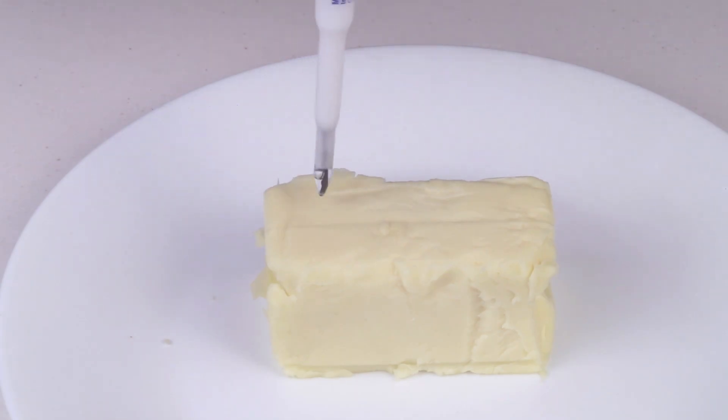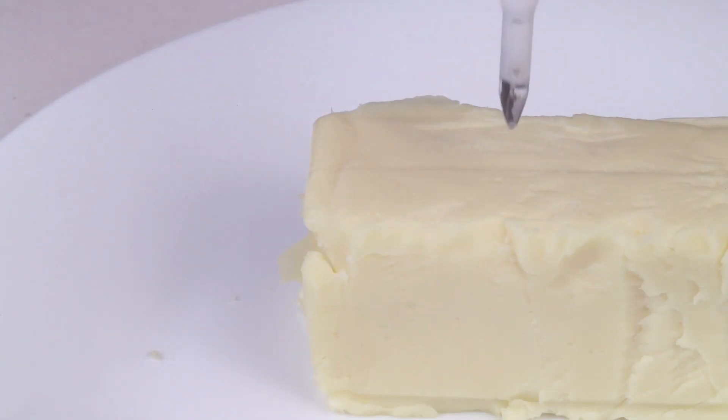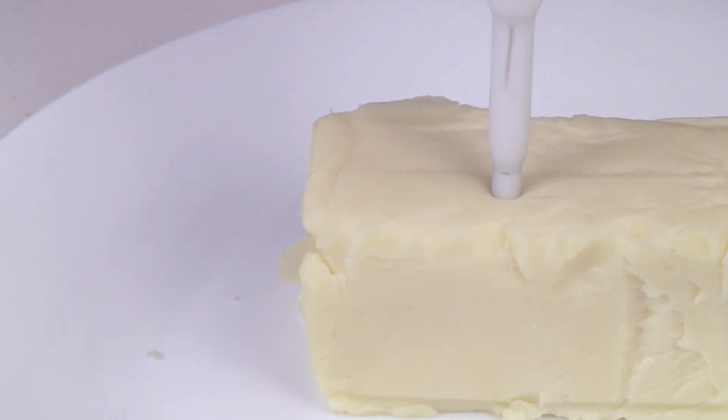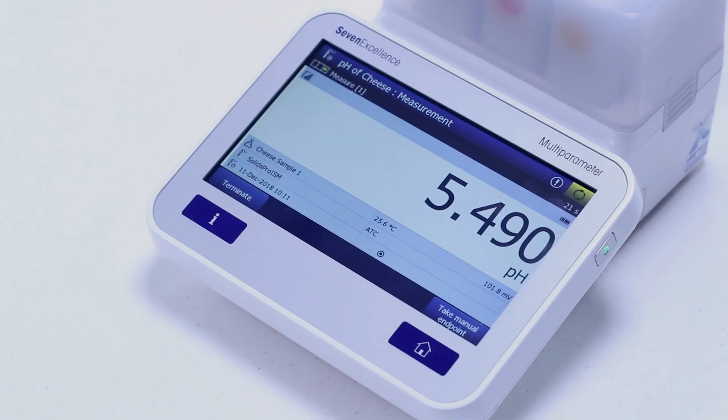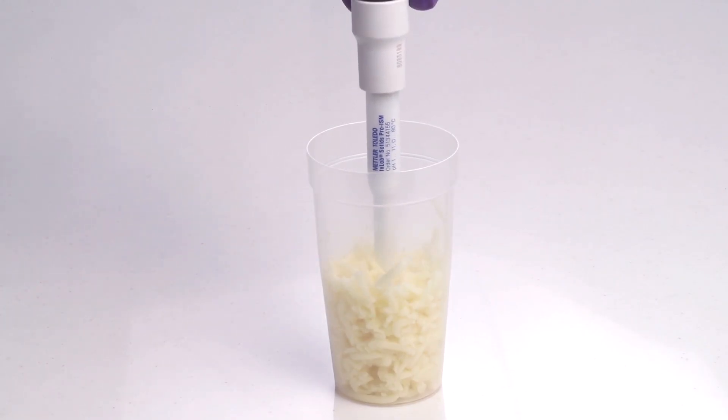Measure the pH by gently inserting the electrode into the sample. Make sure that the open junction is completely immersed into the sample. Repeat the measurement in triplicate at various positions to obtain a representative pH reading. Alternatively, the cheese sample block can be grated for the measurement, and the sensor is dipped in the sample such that it is pressed against the sample mass.